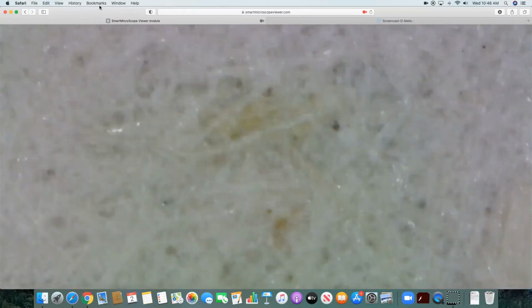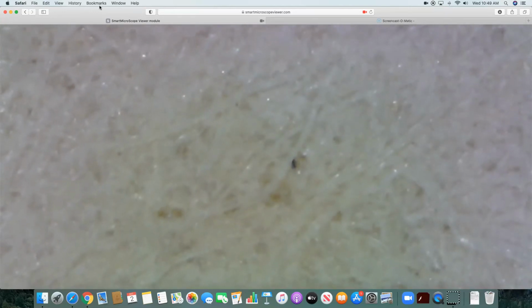The older 93 versus the newer 2017. What are you noticing? What's the difference? Newer, older? So what are some things you notice that are different? So those are normal paper pages, obviously.